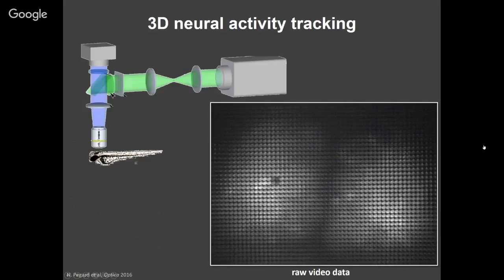Okay, so finally getting to the neural activity experiments. Here's our microscope. It's a light field microscope. It's just a regular fluorescence microscope with a microlens array, and then the microlens array is relayed onto the sensor. The relay is just because we physically can't get the camera up close enough there. And actually now our setup is combined with the 2 photon setup so that we can do our ground truth experiments.